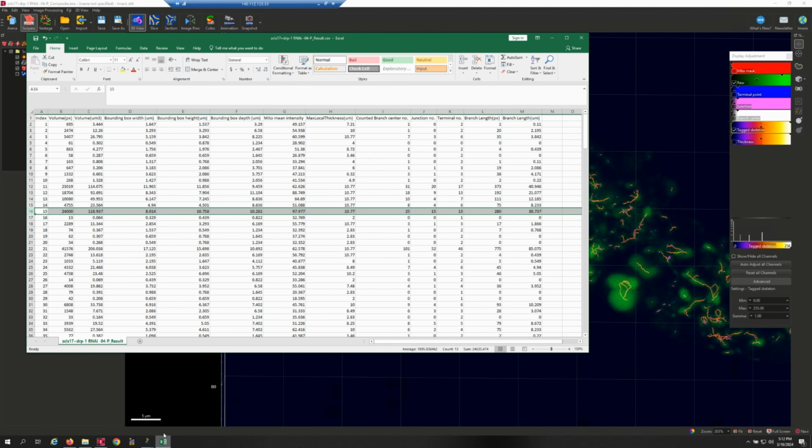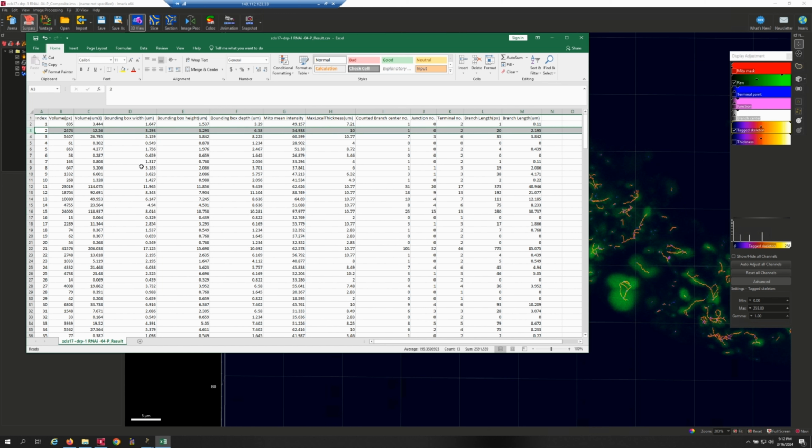If you're interested in a particular string in the table, or a specific piece of data, and you really want to know exactly where it is in the image, what do you do? Let's select one. I'll first check that the file is correct. 17, DRP1, number 4, OK is good. So its numbers are correct. For instance, if I want to know this one, I want to know where number 2 is. Yes, where number 2 is.